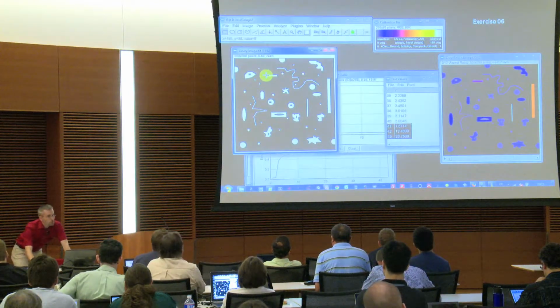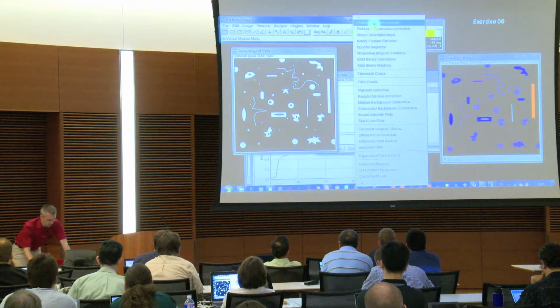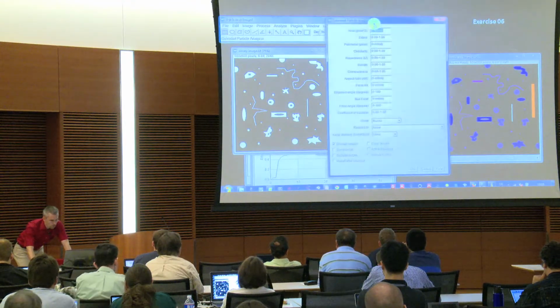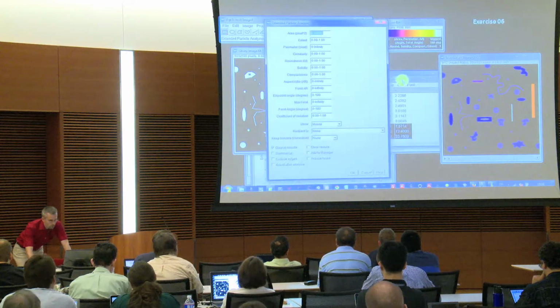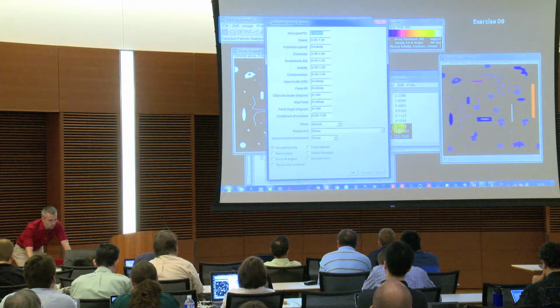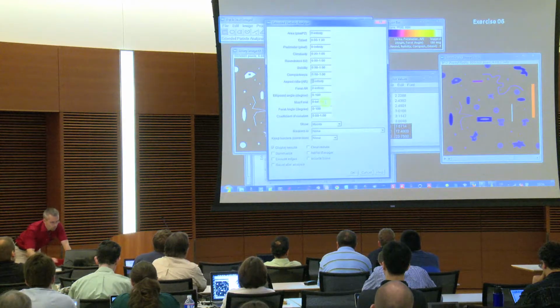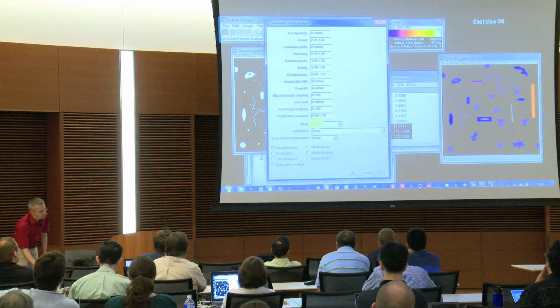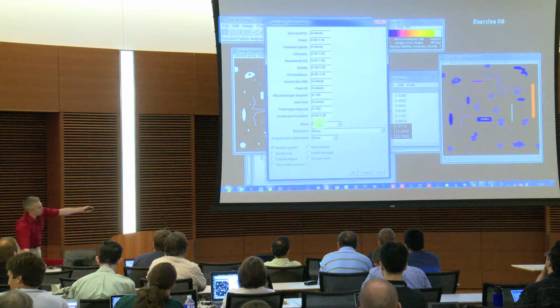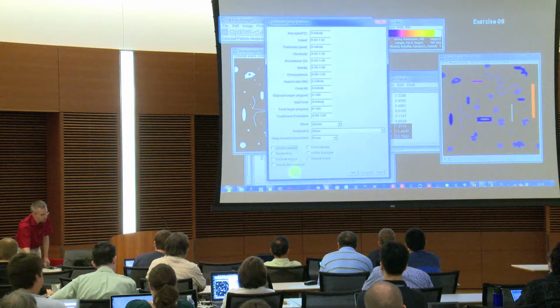So I can go to my original one, then go to the green cube and run the extended particle analyzer. Then I'll search for the aspect ratio, and we said here that, yeah, like something around 5, between 3 and 7. So if I use here the aspect ratio of 5 to infinity, as an output option, I want to have the masks again. I don't want to see my results now, just to show you what you can extract.